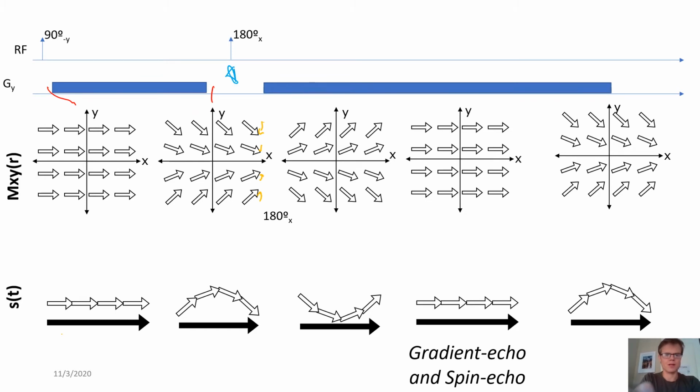So the 180-degree pulse here flips MXY, or it inverts the phase.